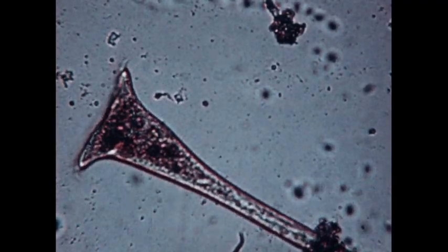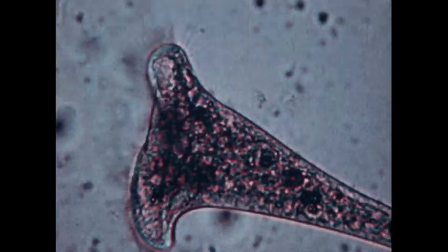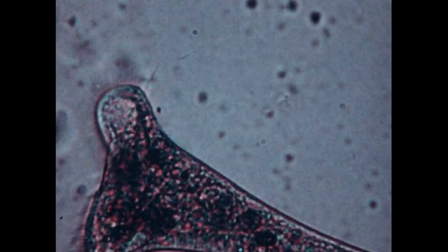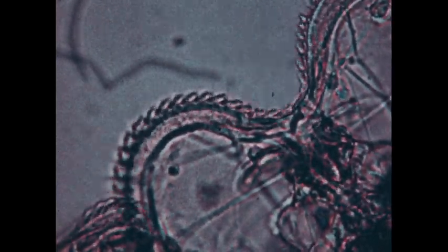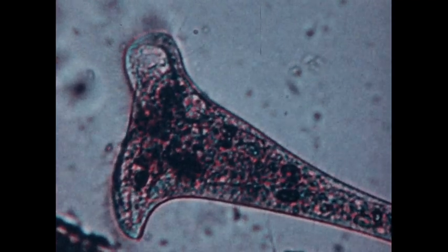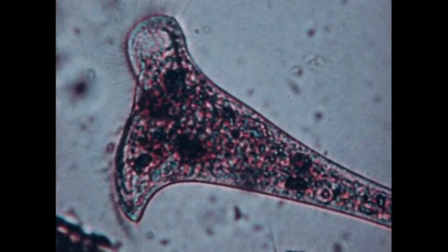A giant of the microscopic world is Stentor, the trumpet animal. Its single cell may stretch out to 1/10 of an inch. Like Paramecium, its body is covered with small cilia, and like the bell animals, its mouth is encircled by large cilia. In Stentor, the cilia around the mouth are fused in groups called membranelles. Actual grains of pigment in the body will give color to the various species of Stentors: brown, green, or blue.